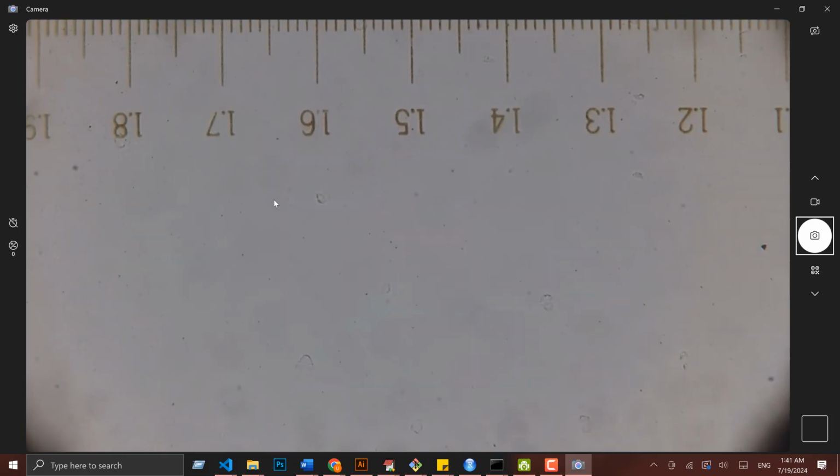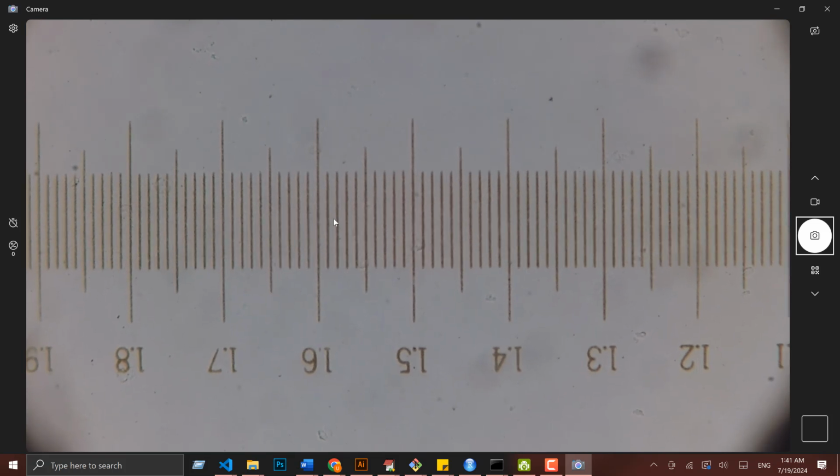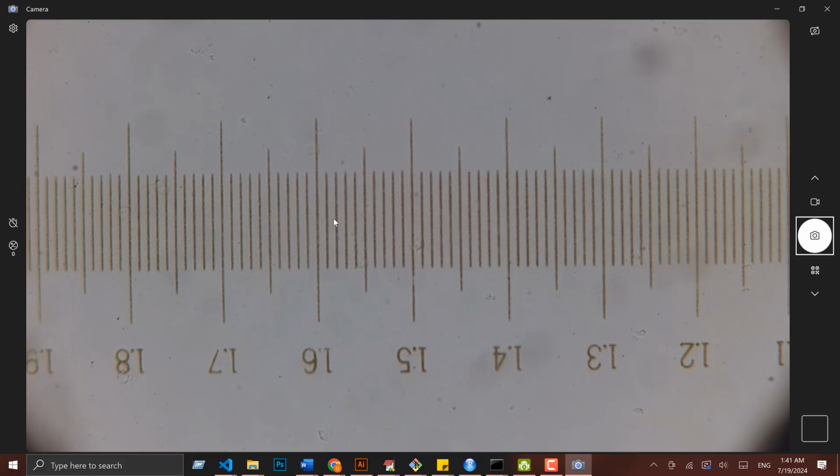First, I'm going to fire up my microscope. I am using a very old refurbished microscope and using my GoPro. The most important thing that I need to keep in mind is to have access to a micrometer. Micrometers are reasonably cheap as well. Sometimes you find them for as cheap as $15 from AliExpress, and then you will have to wait for a month or something and it will eventually get to you. This scale bar is necessary to have an idea of how many pixels represent a particular unit of measurement in our program.